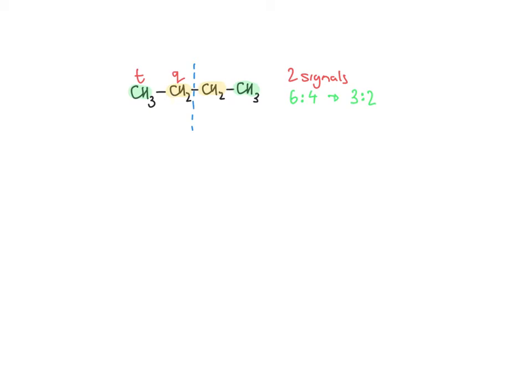Let's have a look at another example. You have to think, first of all, about how many unique hydrogen environments you think there are. So maybe just pause the video. All right, so they are equivalent to each other. I'll talk through why that is in a second. We've got a hydrogen in the OH group. We've got a hydrogen there, that's unique. And then finally, we've got this methyl group at the end. So this molecule would result in 4 signals.